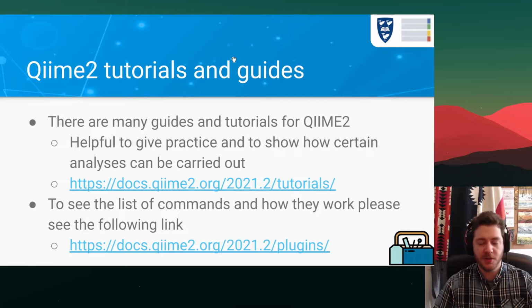So, QIIME 2 tutorials and guides. There are many guides and tutorials for QIIME 2. You can go onto this link and it'll give you practice and show how certain analyses can be carried out. Definitely one of my suggestions is when you're learning a new process, if you can do multiple tutorials, that's always useful. When I first learned 16S analysis, I went to a workshop and then I did an online tutorial, followed by another online tutorial, and then I started doing analysis once I felt more comfortable doing it. I was thankfully given the time to do this.